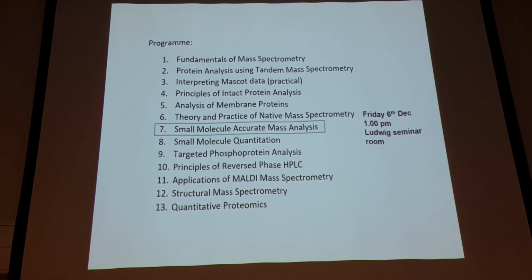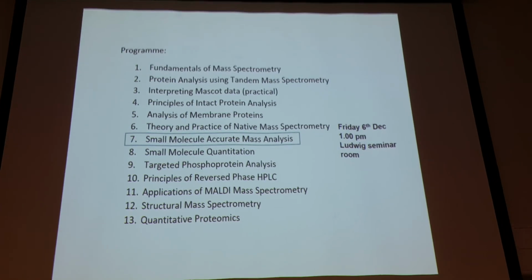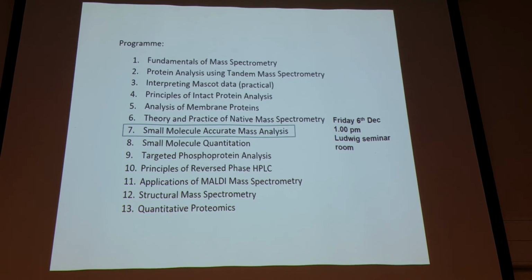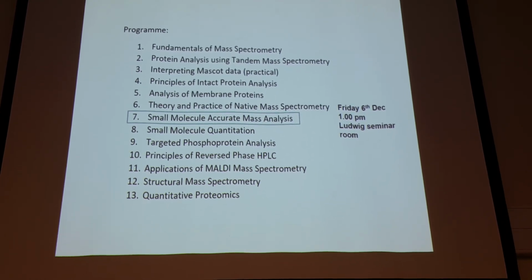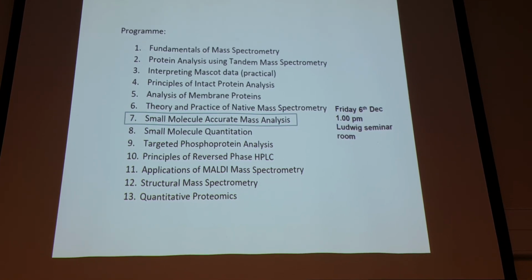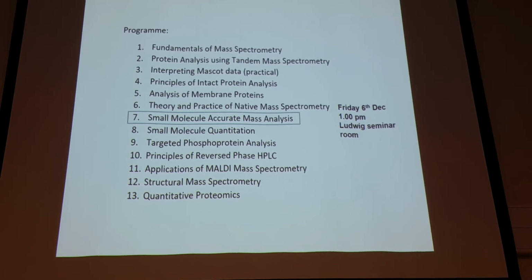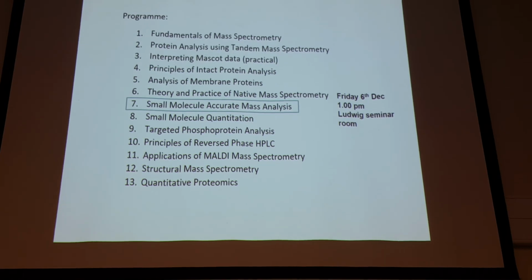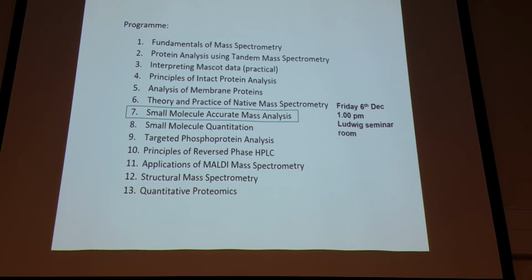Why no DMSO? And what's the threshold? Before you start, I wanted to show you the picture, but there just wasn't time. We've done some experiments with DMSO on HAL1. The problem with DMSO is it's non-volatile. People say it's okay, when you're doing screening it's normal to use DMSO, and I think it's true to say it probably doesn't have any effect because it's very low concentration. The problem is it's non-volatile.